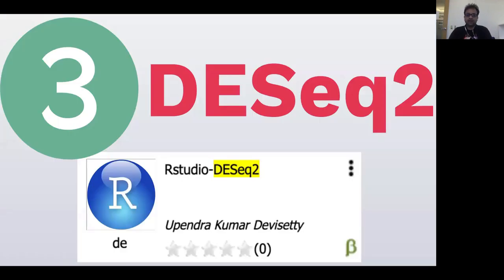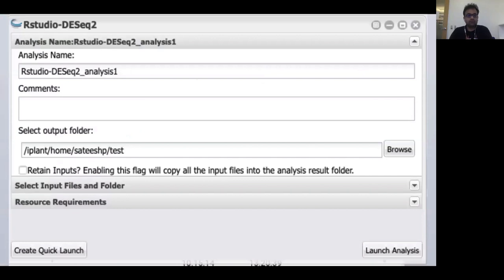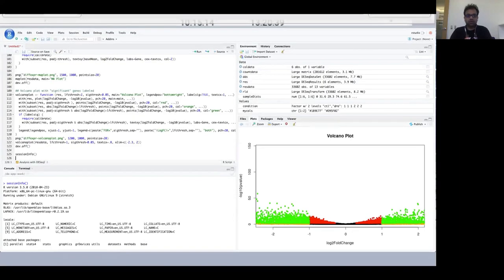Once we have the read counts from the RMTA app, the next step is differential expression analysis using the DESeq2 package. This DESeq2 package is launched as part of an RStudio interface, which is a VICE app. VICE — Visual Interactive Computing Environment — is a new feature in Cyverse which lets you launch interactive apps such as RStudio. Here is the interface of the app you'll find in the discovery environment, and once you launch it, you will be presented in RStudio with the DESeq2 package pre-installed, which you can open in a web browser.